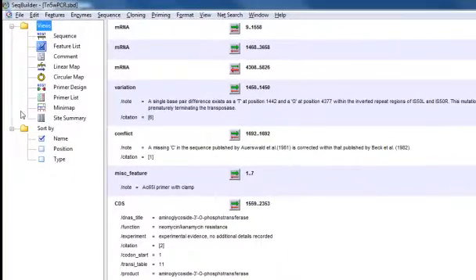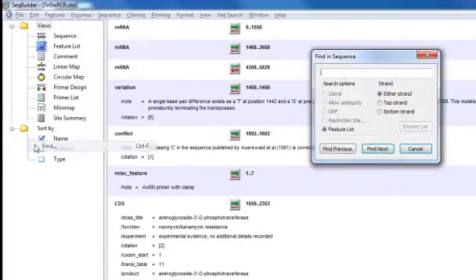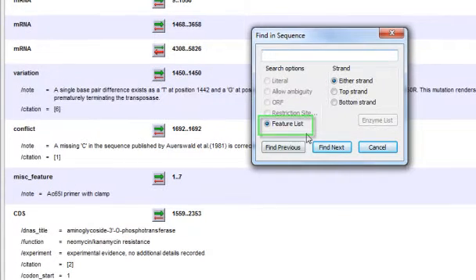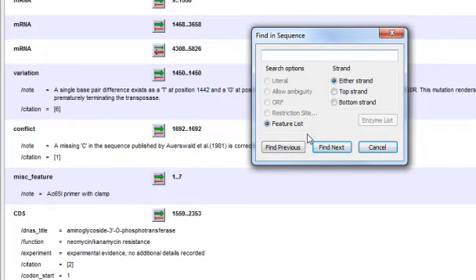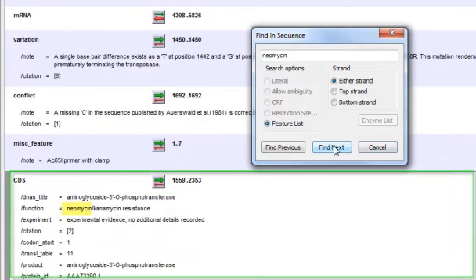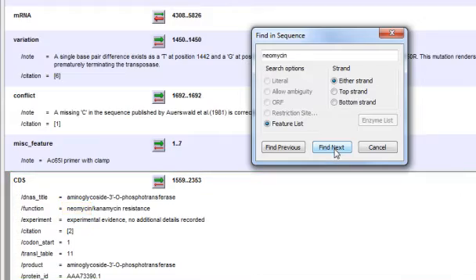You can also search the Feature List by selecting Edit, Find, and notice that Feature List is selected here under Search Options. You can enter in any string that you want to search for, and then SeqBuilder will search all of the qualifier fields for each feature in your project.